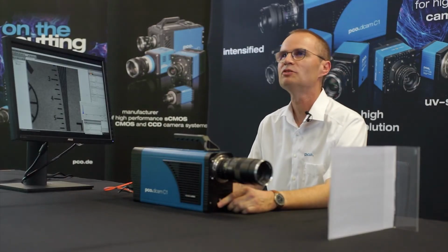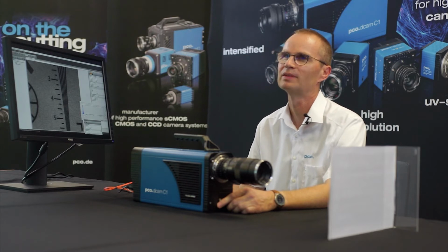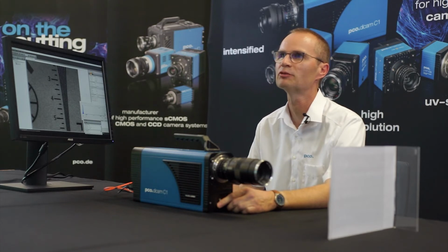Maybe I can convince you that this noisy appearance of intensified images is really mainly shot noise. In other words, it's physics that we can't change. And it's not due to a poor camera system. Let me try the following. As always, if you can repeat the measurement, do it and improve the precision of your result by averaging. Here, I will reduce the shot noise by averaging images.